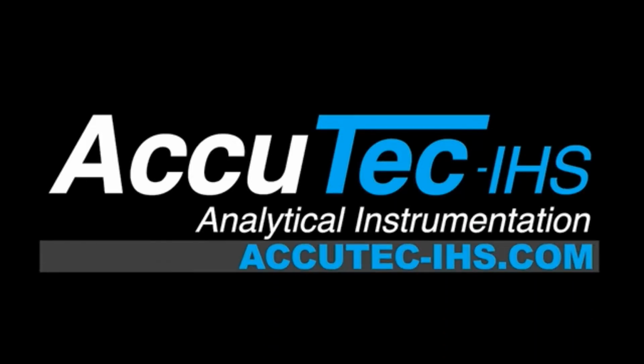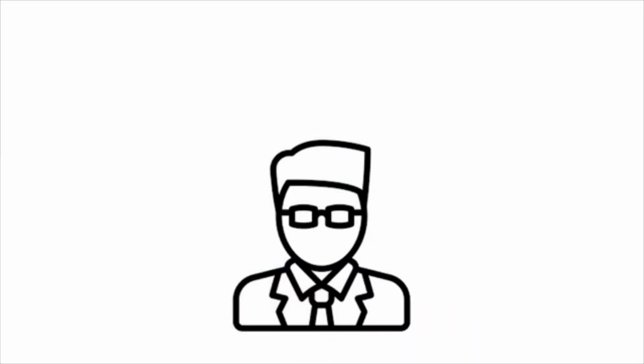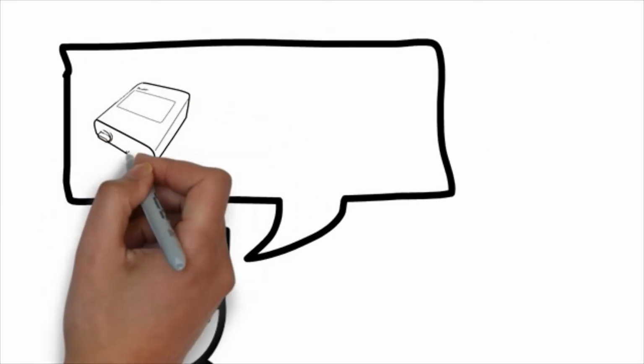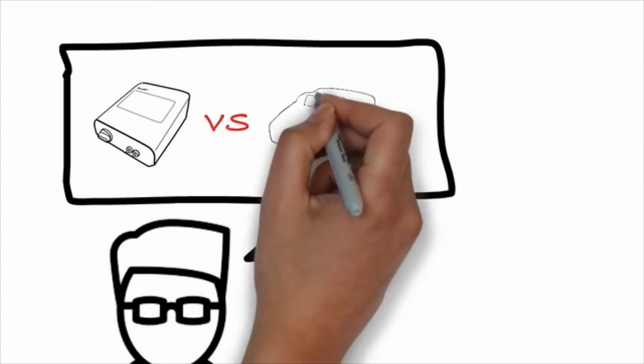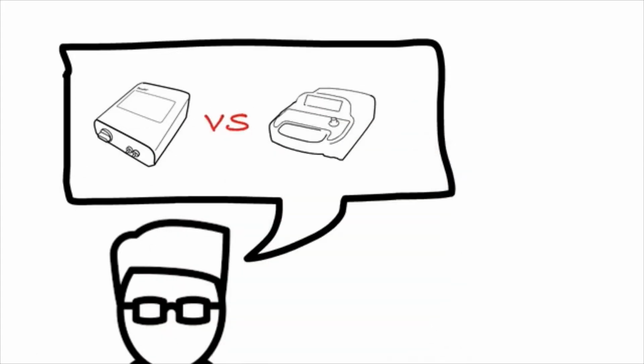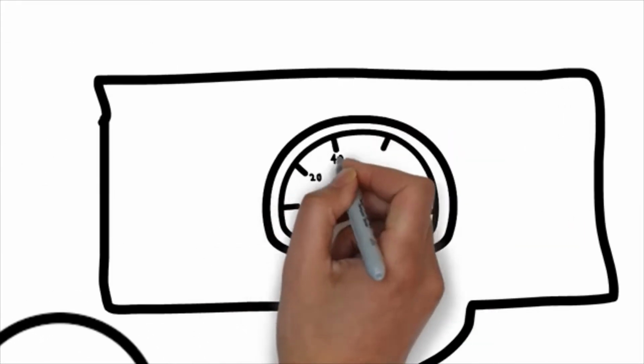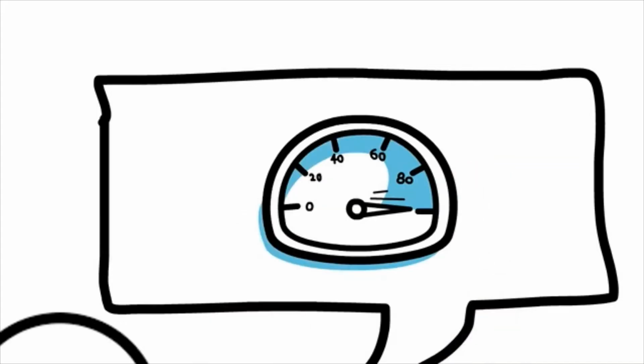I understand that respirator fit testing is becoming more important all the time. Looks like there are two methods for performing quantitative fit testing: CNC and CNP. What's the difference? You're right. There are essentially two methods currently in use to perform quantitative fit testing of tight-fitting respirators.